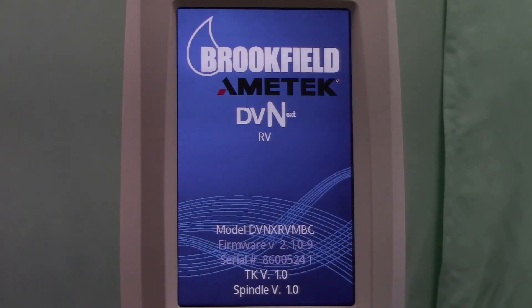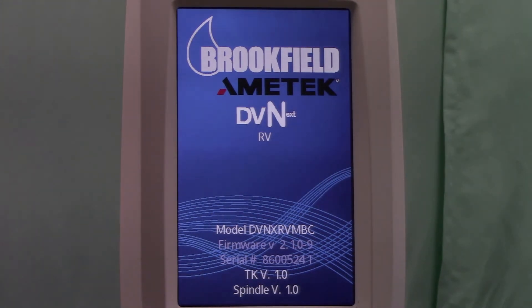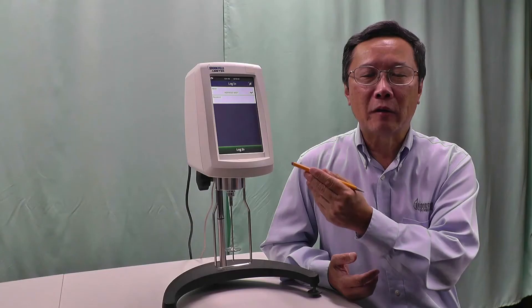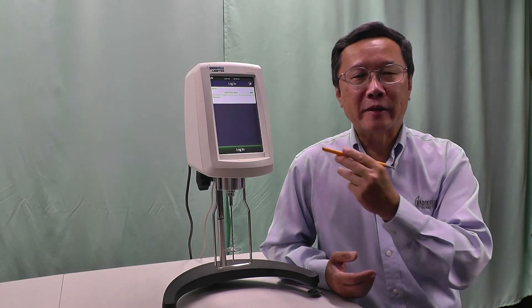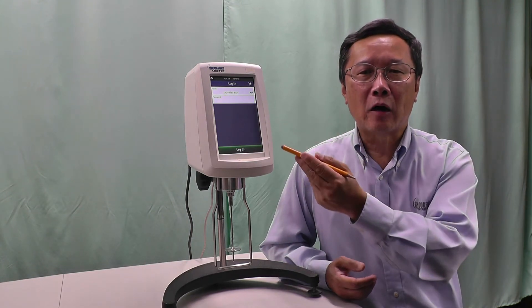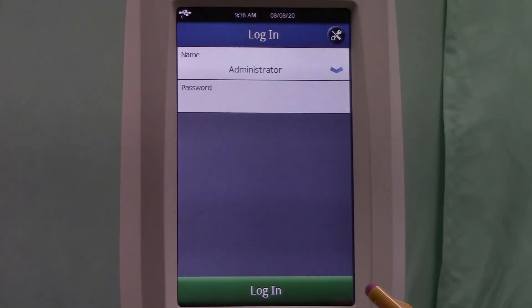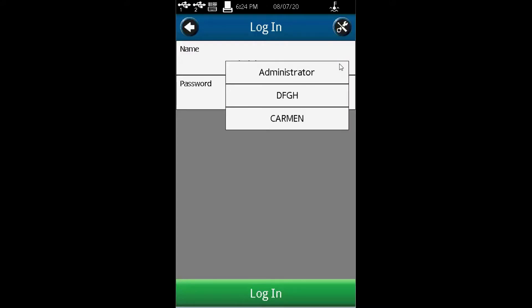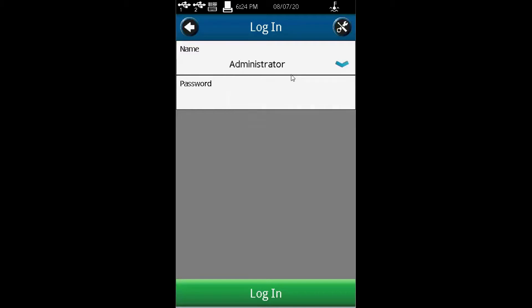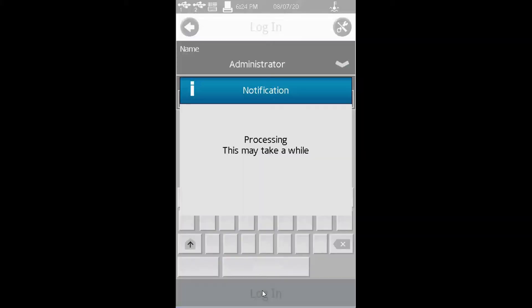When you turn on the power, the DVNEX welcome screen will show you the model, firmware, and serial number of the viscometer. You will be presented a login screen. When you log in, you have to choose which user you're going to use. In this case, I'm going with the administrator, and you need to put in a password and log in.